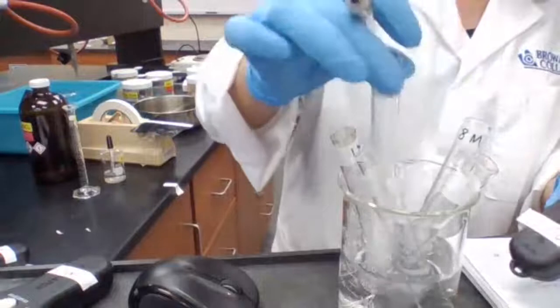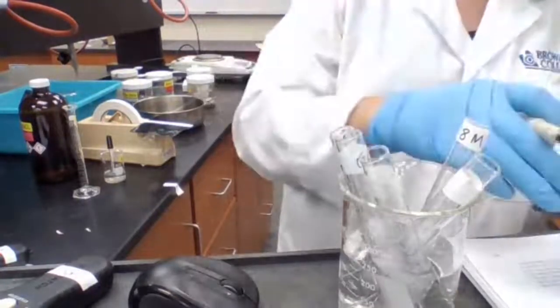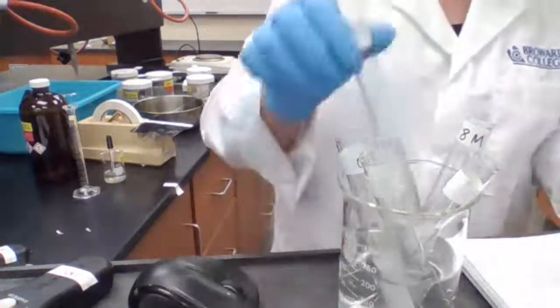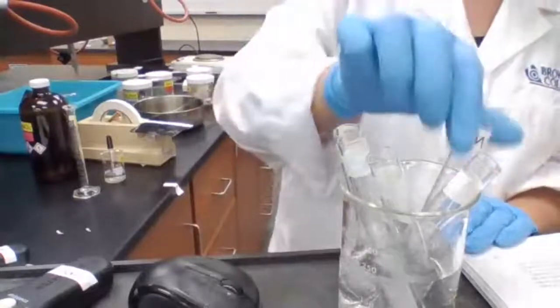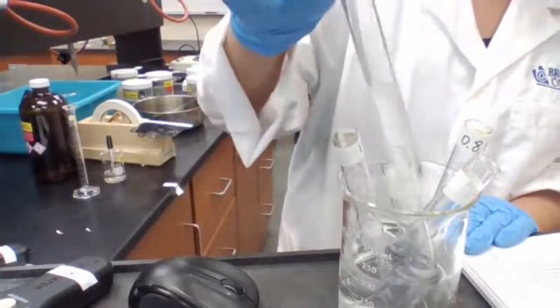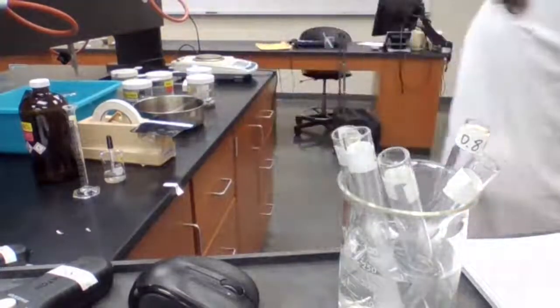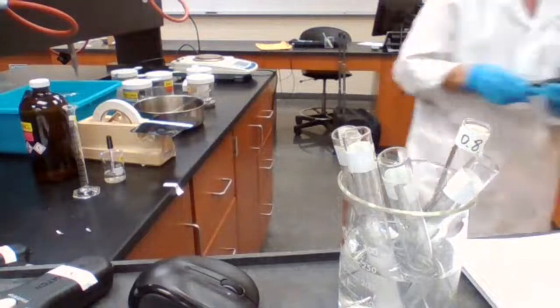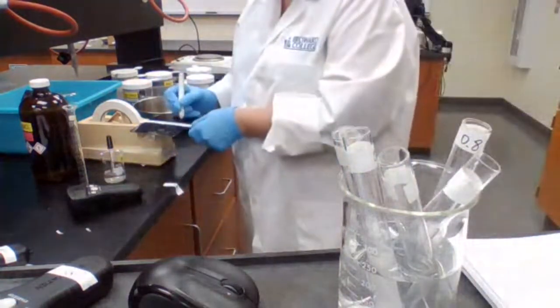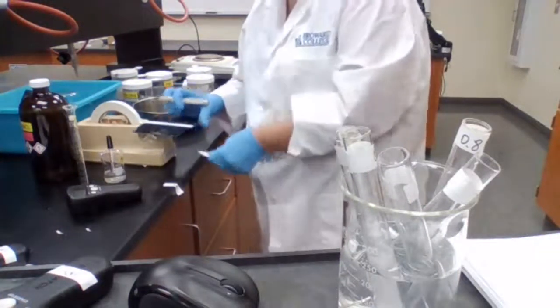And it says the deal is that they should completely dissolve. If I can handle more than 3 timers, I can get another one and add another timer, because some of these reactions are going to be very long. 0.4 timer.